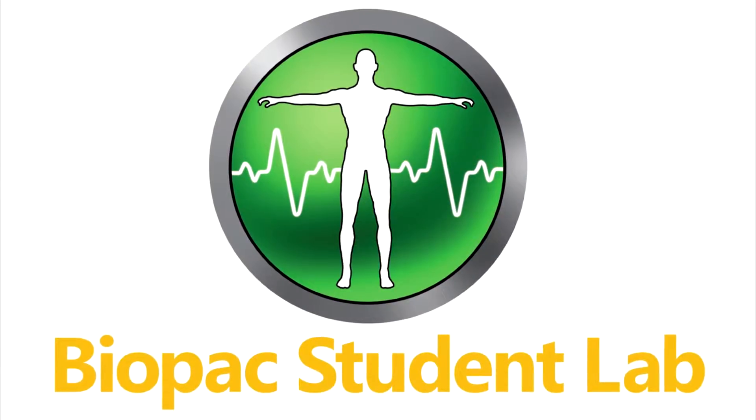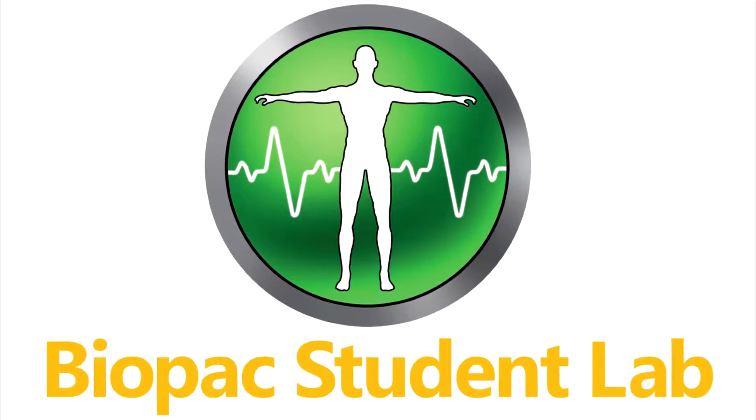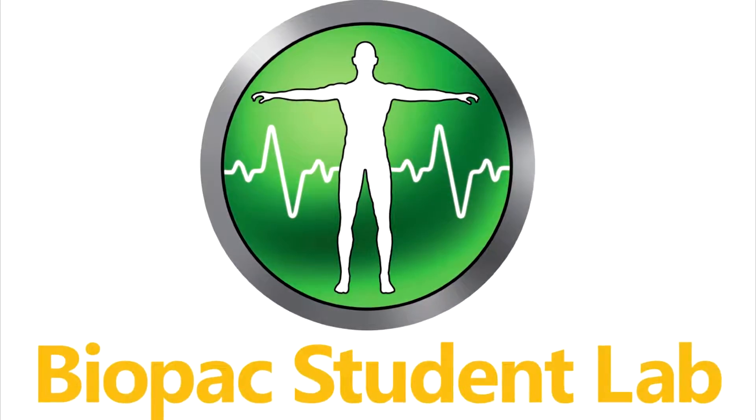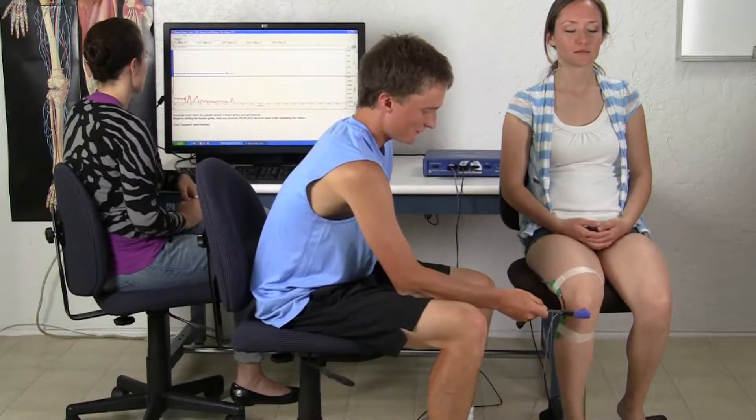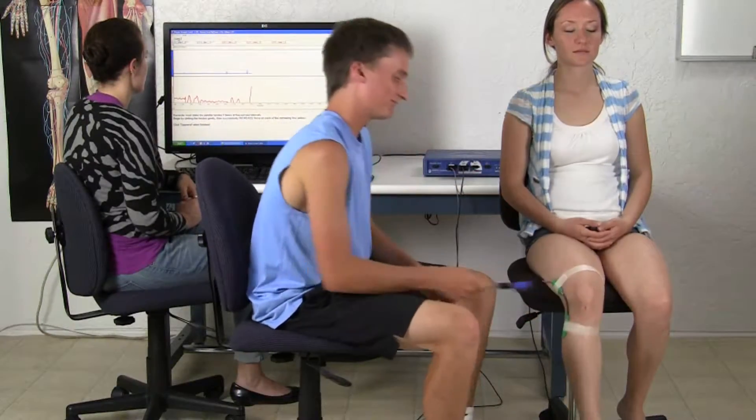The Biopac Student Lab is an integrated system of hardware, software, and curriculum used by thousands of labs worldwide at two-year, four-year nursing and medical schools for undergraduate and graduate life science studies.